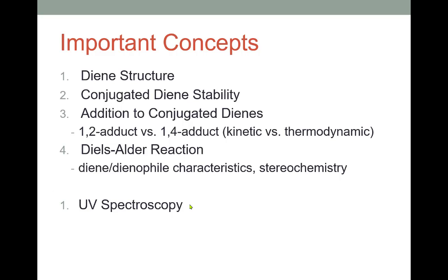It's not nearly as wide-ranging of a technique as IR or NMR, but when we're trying to detect conjugated molecules, it's a really easy, very low cost, very accessible way to do it. And we can use that to quantify things, as I mentioned there with DNA and RNA. We can use it in the development of dyes and fluorophores for microscopy and all sorts of practical applications.